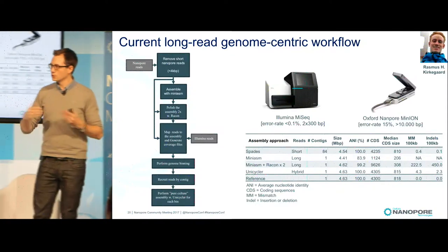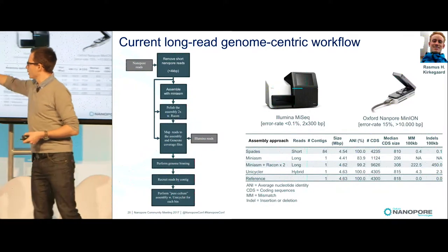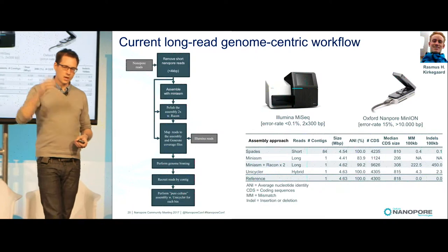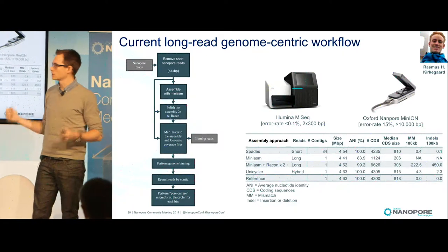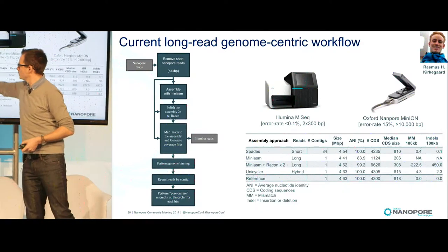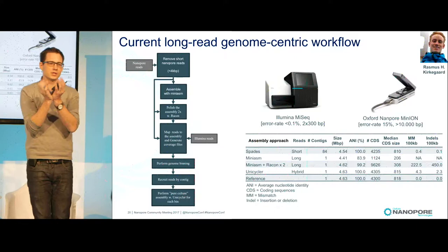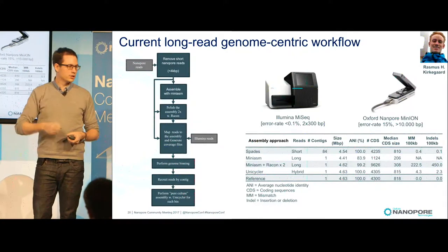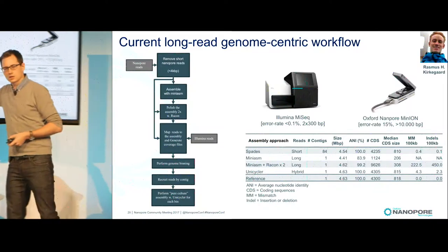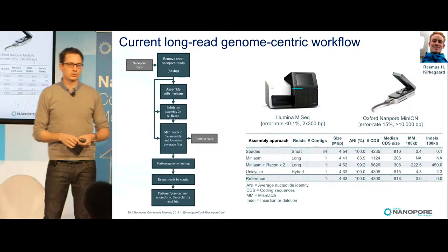So we take all our Illumina data, and we still do a lot of Illumina data for different time points. We map it down, so now we have a big assembly and differential coverage data, and we can start to bin the data out. From this assembly, we do binning, so we take out small pieces that we think are a single genome, and then we recruit all reads, all long reads and all short reads, and treat it as a completely normal genome assembly using Unicycler or the other tools available.